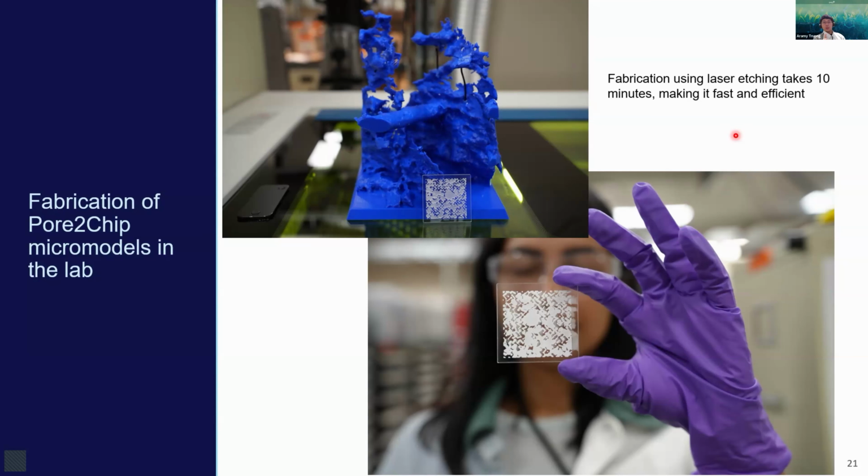You can go a little bit lower with some tuning, but 50 is usually where we say, okay, if you want anything tighter than this, with more tight designs or shapes, we would recommend photolithography, which is of course more time consuming, but it can get you micron details down to 1 micron, I believe. And here's a picture of one of our researchers, Arunima, holding it up just to show that it's real and not fake.